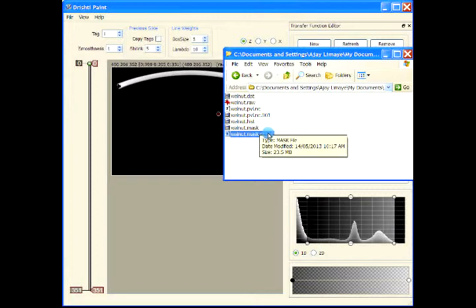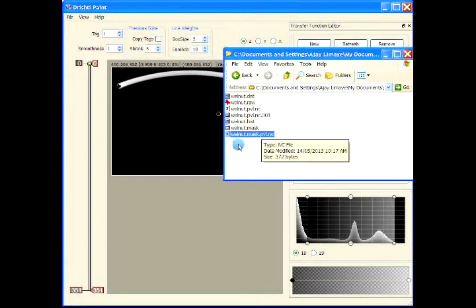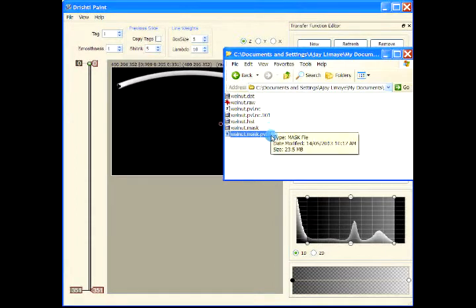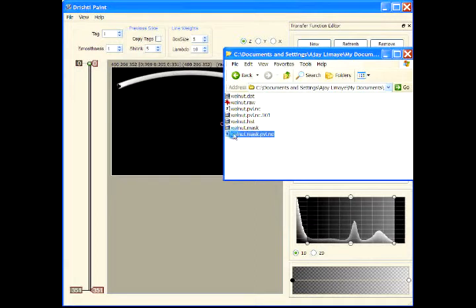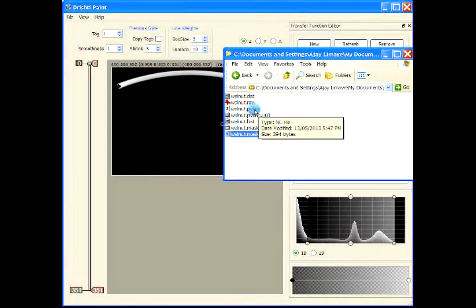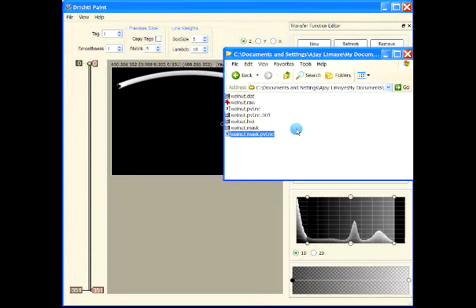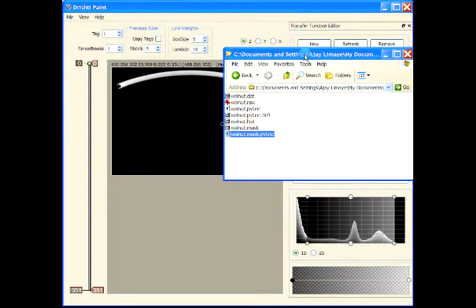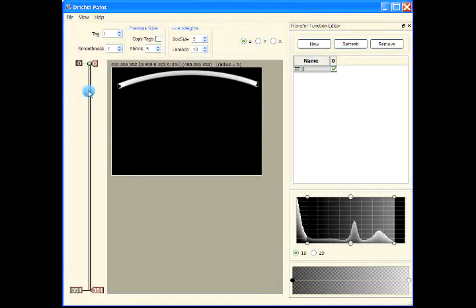When you have done your segmentation, you can drag and drop this file into the renderer and you'll be able to see your segmentation. Or you can use the mask file .pbl.nc along with your original .pbl.nc file and use 'Load Two Volumes' to view your segmentation on your original dataset.